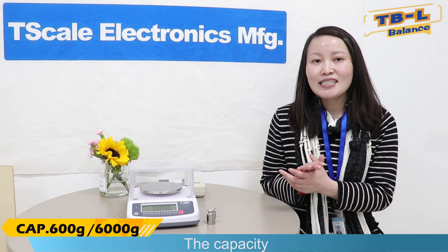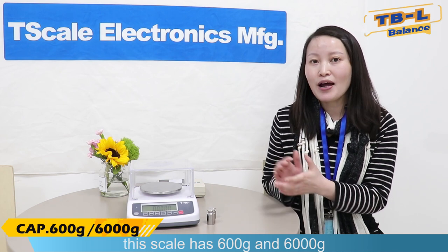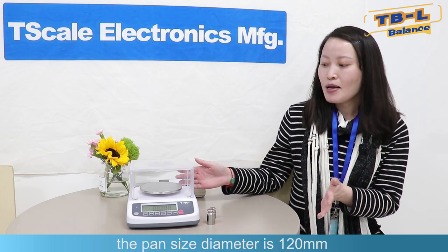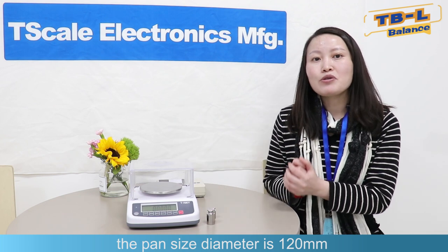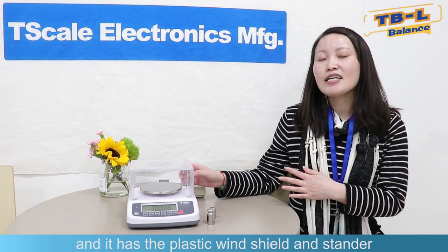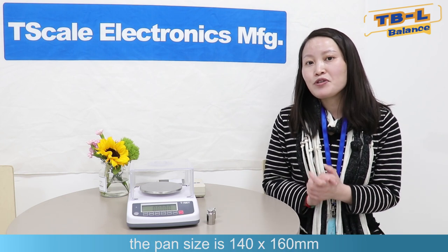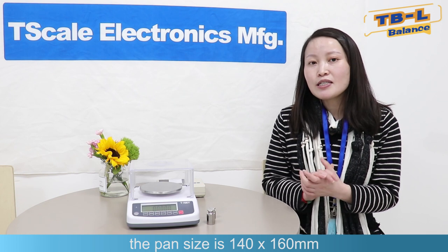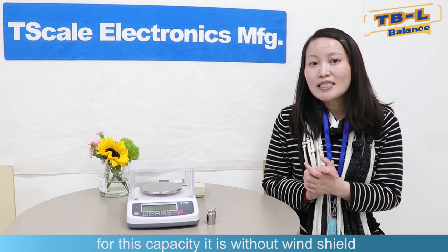On the capacity, this scale has 600g and 6000g. For 600g, it uses the round pan. The pan size diameter is 120mm and it has a plastic windshield as standard. For 6000g, it uses the square pan. The pan size is 140 by 160mm. For this capacity, it is without the windshield.